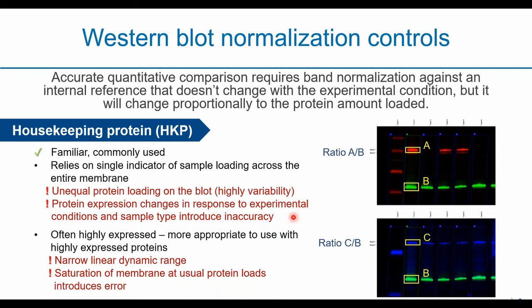Another very important thing is that the so-called housekeeping proteins are not really housekeeping in that sense, because we do find out, in certain publications or maybe in your own experiment, that these housekeeping proteins do change according to the experimental conditions, even sample type, cell type, disease, treatment type, even the time point that you harvest, even the day that you harvest, or even the weather, ambient temperature, and so on and so forth. So there are a lot of factors actually affecting this.